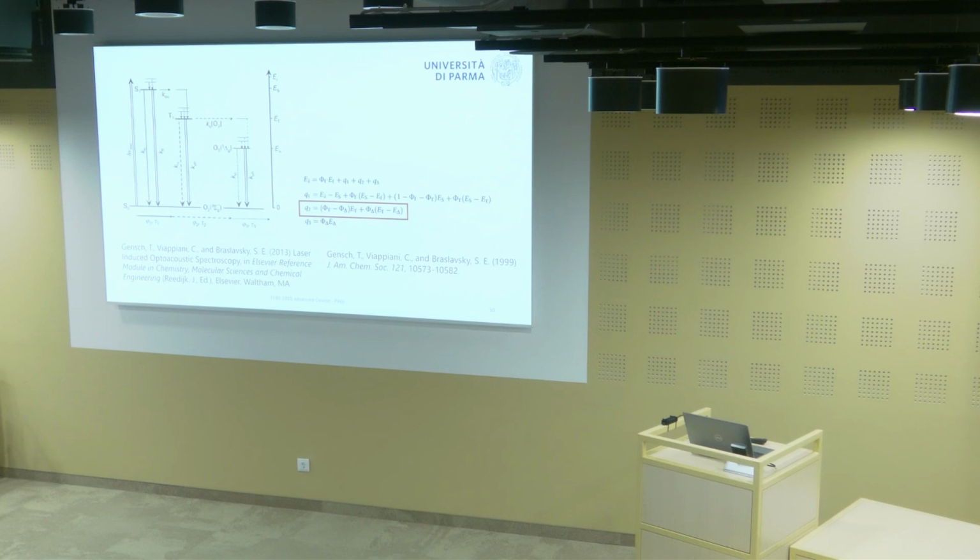So it's a simple molecule, but translate that into a more complex system. It can be intermediates in your photocycle for photoreceptors. If you are able to separate the steps, you can calculate the energy content of each of them, something that is otherwise very difficult to get. Plus, you get the lifetime of the relaxation without any need for a chromophore, because the signal comes out for itself.